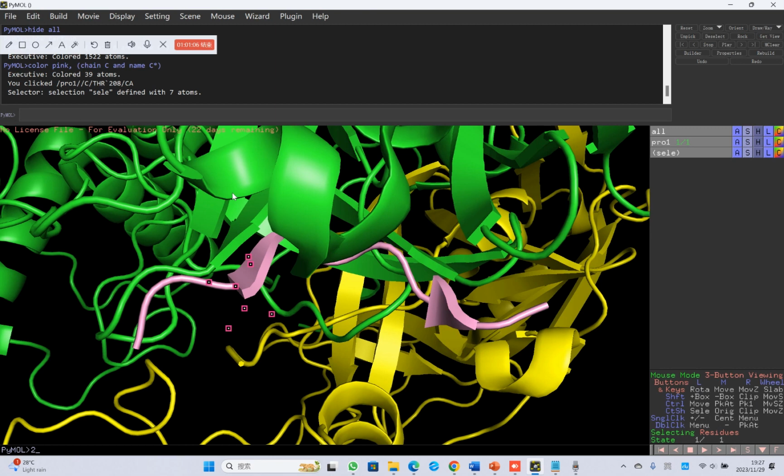You see, I'm here troubleshooting where your folder is, where your file is, which typo you made. How can we find where is P1? Okay, you can show sticks.